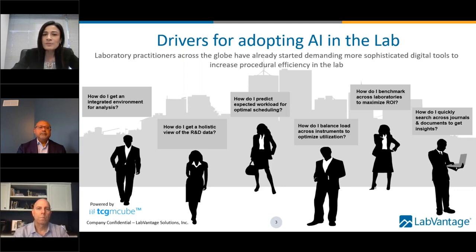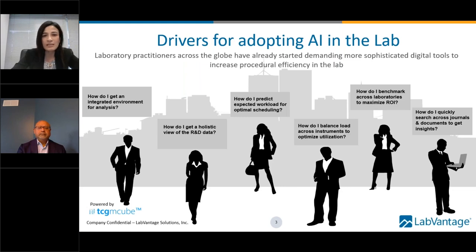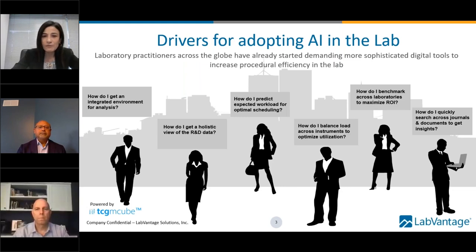Currently, our lab systems are not integrated with any analysis software. We use third-party software, and this leads to a lot of manual effort in data handling. This not only increases analysis time, but also increases the risk of errors that we run. They ask me questions like, I put some of the questions here.